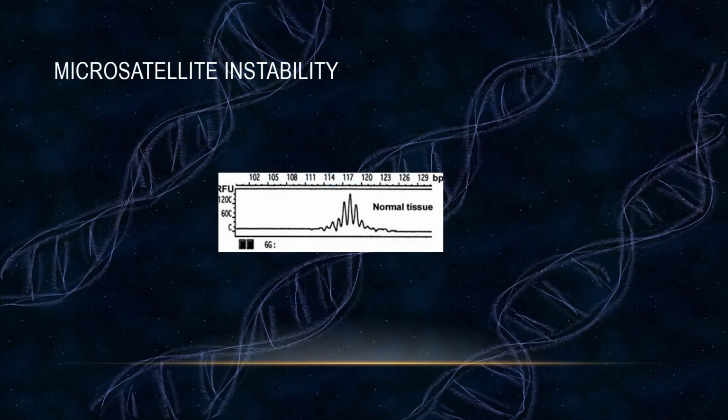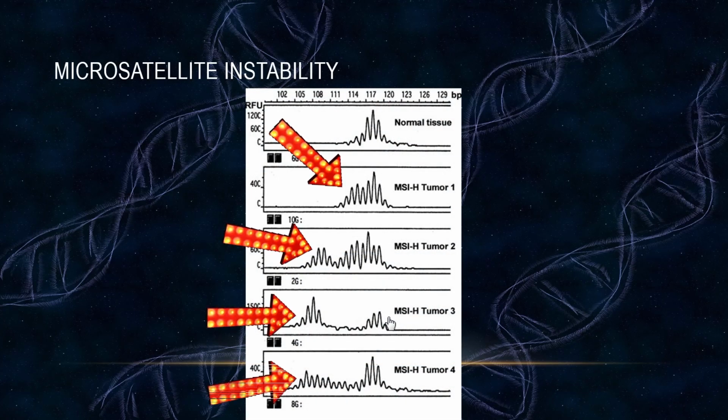So when you look at the result of this, it looks something like this, and it's a little messy because we're doing the PCR on these microsatellites, so we're introducing some slipping of the PCR as well, some stuttering. And in a lot of cases, you only see one set, even though you'd think the person might have 2 different numbers of repeats. A lot of them are monomorphic or pseudomonomorphic, meaning most people only have 1 repeat number. Of course, people choose different repeats for different tests. So if they're doing identity testing, they want things that vary between people. For the microsatellite instability testing, it's nice to have things that are more often the same.